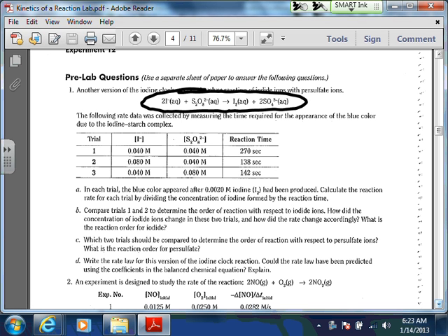So the stoichiometry is not going to tell us. Also, once you get the rate law, I think you're probably going to notice that it doesn't match the stoichiometry in the equation. Because this is most likely not an elementary step, or because the stoichiometry doesn't match the rate law, then no, we have to determine this experimentally.